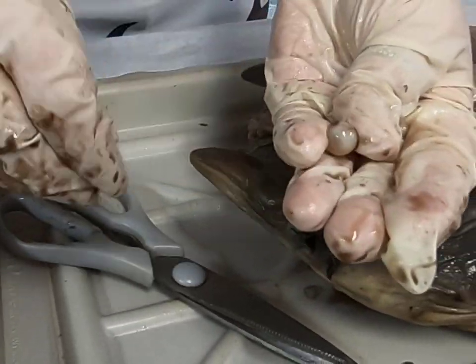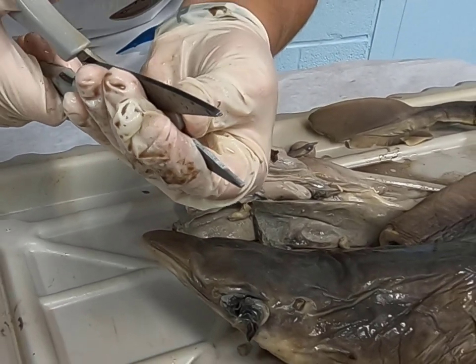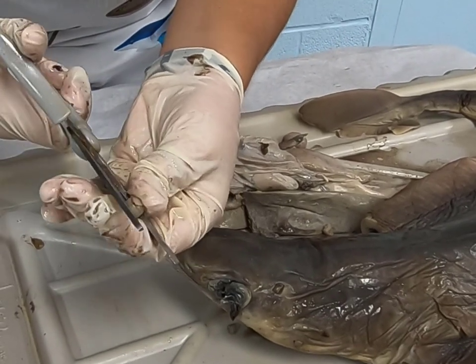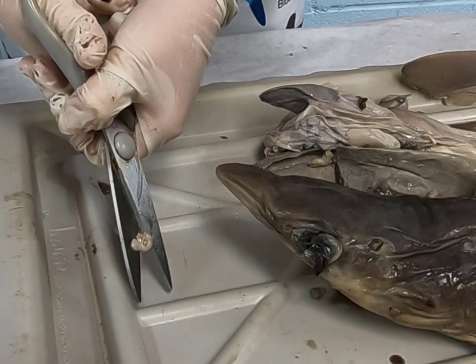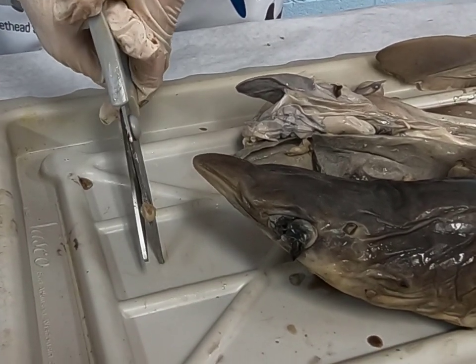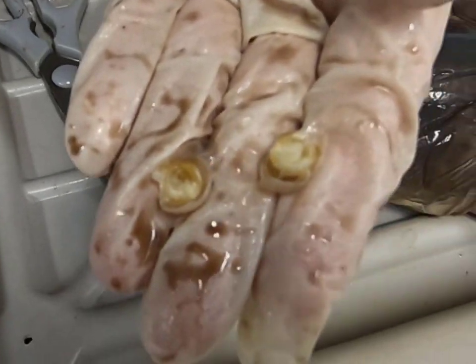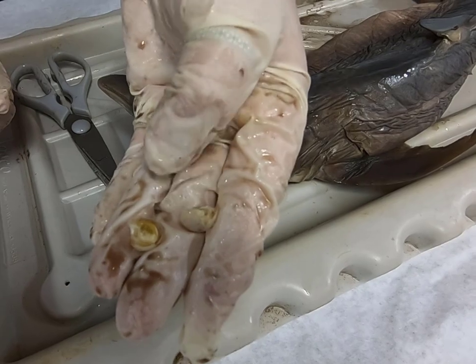And the lens is solid. Everyone always asks me, can you cut into it? So let's try it. It's solid all the way through. This might gross you out, but if you ever eat a gobstopper, that's what these always remind me of. Here we go. So that's what they look like on the inside. They're solid all the way through.